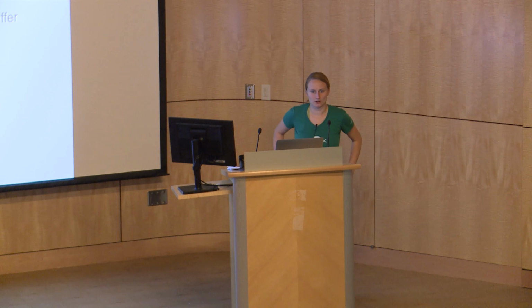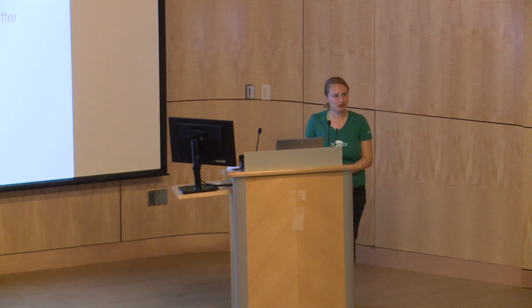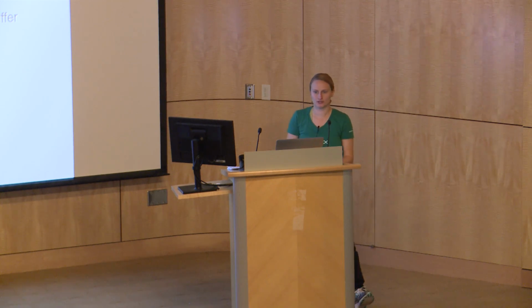All right. So Lin Yi just gave us a good description of how you use CRISPR in the lab. Once you transfect your cells and have CRISPR and your guide in the cells, you want to see: did it work, and how well did it work? There are two different ways that you can read out how well your cleavage worked. The first one that we use is called the Surveyor assay.